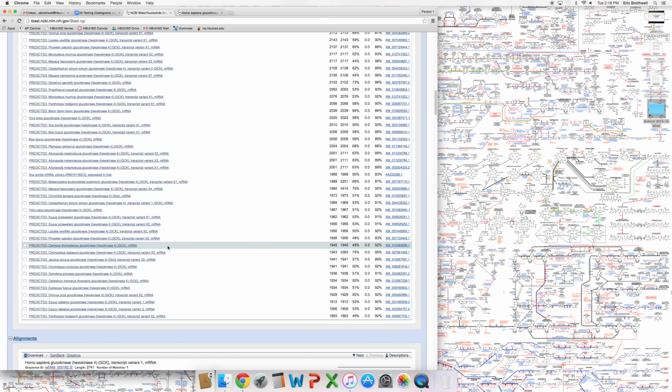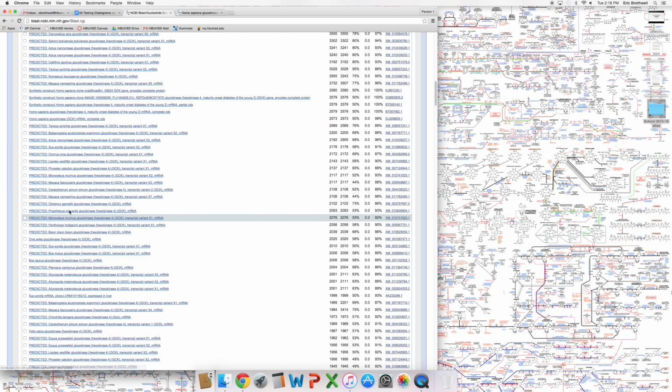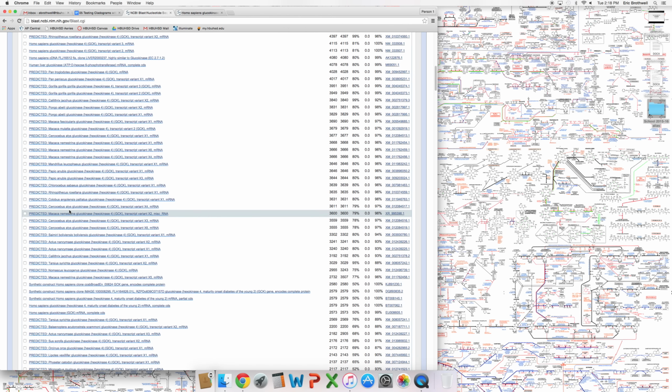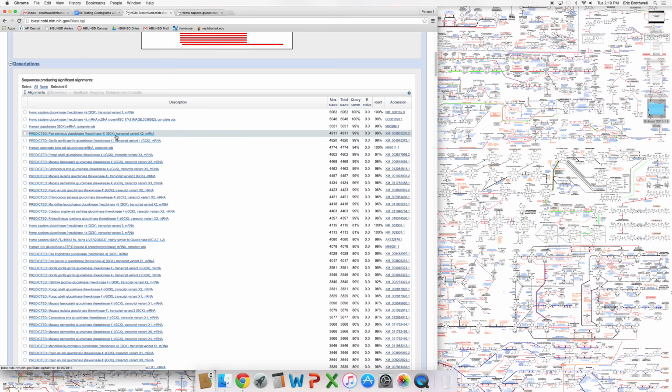So we have all sorts of information listed here. Each of these things is a different organism. Let's see, do I know any? Bison. That's going to be a bison. That one's pretty obvious. Gorilla is obviously a mainland gorilla, or a lowland gorilla, as it were. Troglodytes, that would be a chimpanzee. So some of these are big giveaways as to what they are, and others aren't.